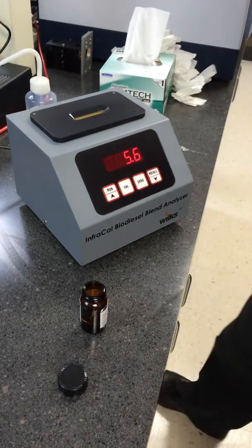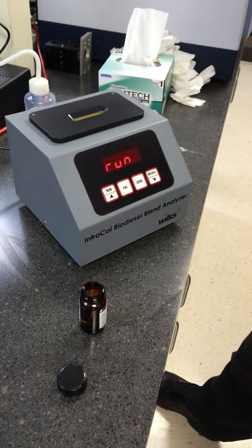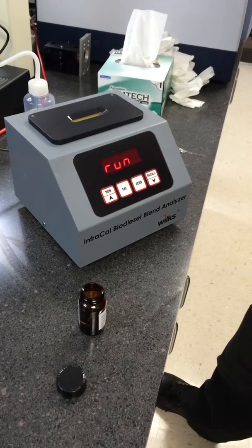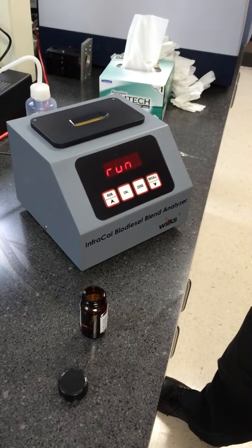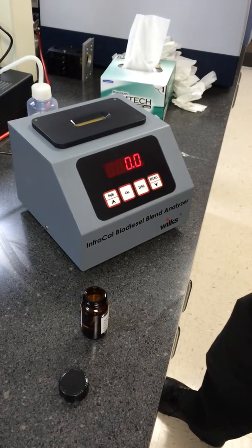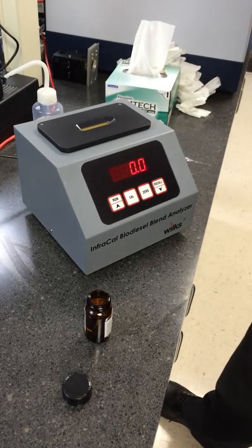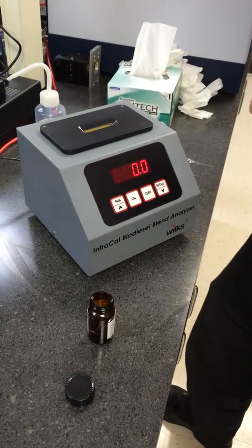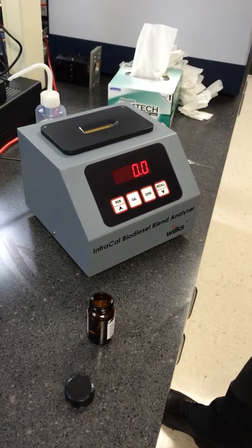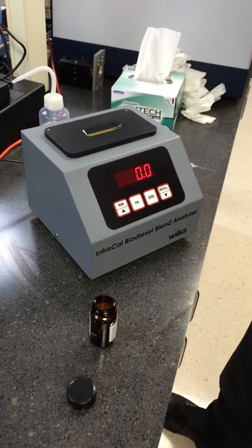To check your zero, hit the run button. If you get a number above point one, then re-zero the instrument again by holding down the zero button. Also, you'll want to make sure to re-zero the instrument if it's been longer than one hour since your last zero.